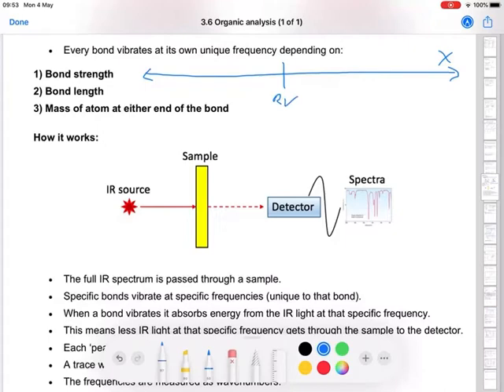So infrared just sits about there, and even the infrared region is a very small range when you look at the entire frequency range of the electromagnetic spectrum, but if we look at just that, we get a range.